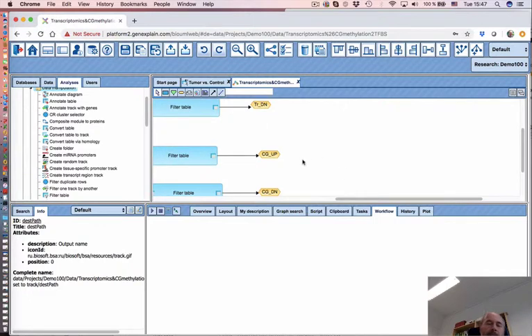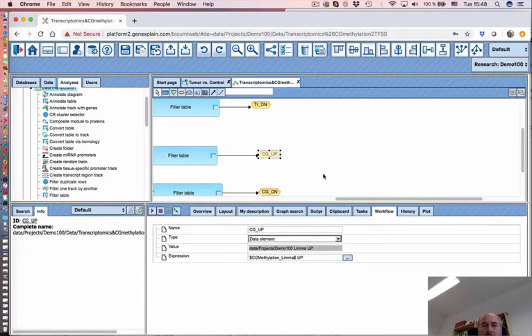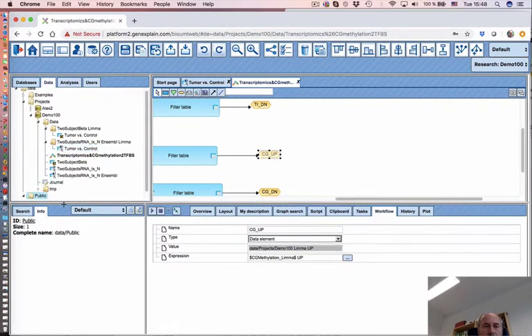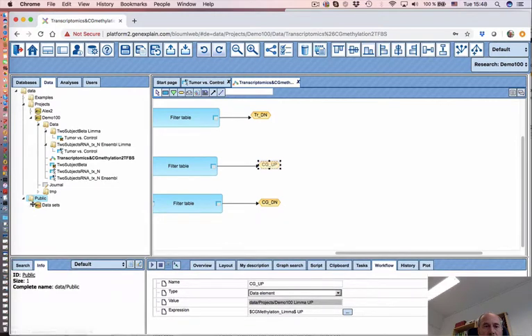As for the methylation, before converting it to the track, we have to know the coordinates for the accession numbers. For that, we have to annotate this table with accession numbers, using these accession numbers to annotate with the coordinates. We have a file which contains those coordinates, located here in the public section of the geneXplain platform.